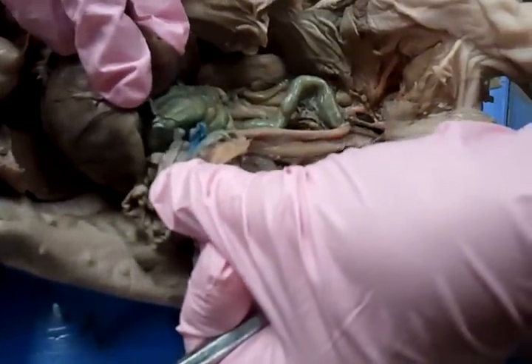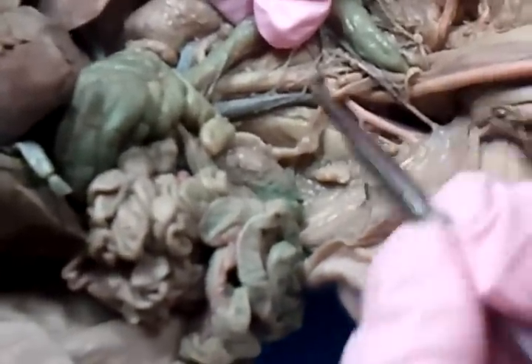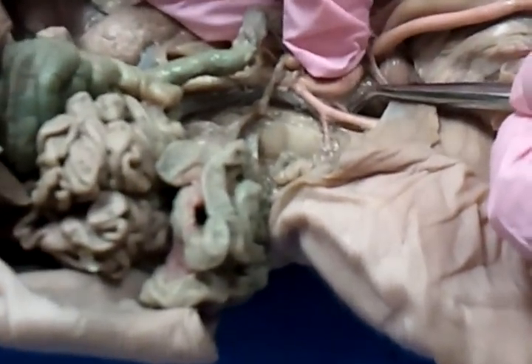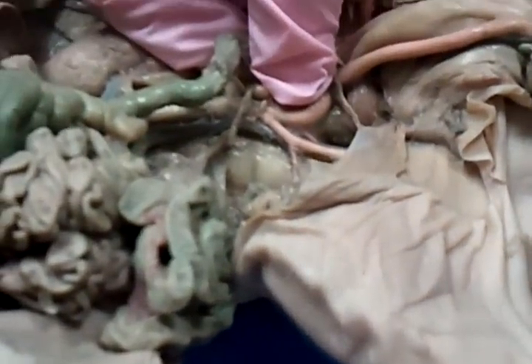That's your umbilical vein. All right. After the umbilical, now your aorta comes to an end, and it has 2 big branches off of it. Those are going to be your external iliacs. So if you see here, here's your aorta, and then all of a sudden you get this branch, and there'll be one on the other side. There's 2, the aorta splits into 2 branches. Those are your external iliac arteries. Then inside that, a little deeper down, a thinner branch right there, that's your internal iliacs. Your internal iliacs will be medial, inside of the external iliacs.